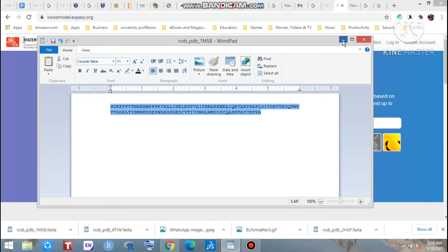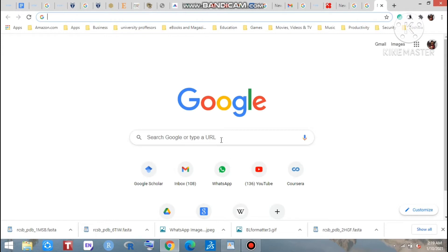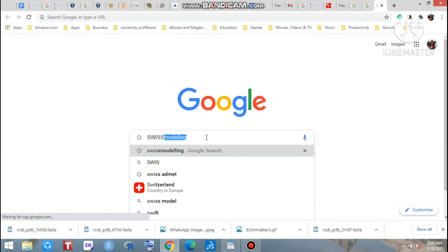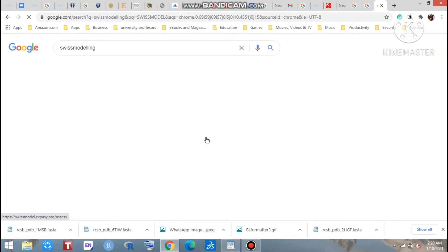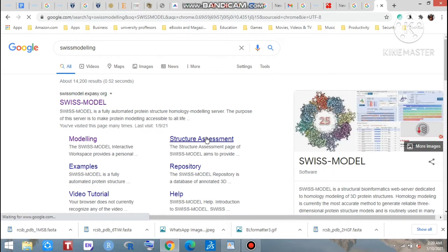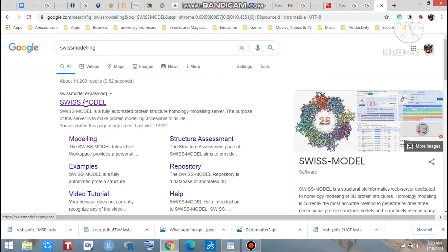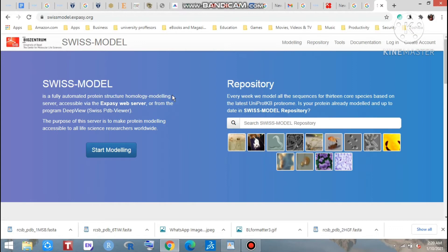At first you should go to the search engine of Google. Just search here SWISS-MODEL. Look at that. If you search here Swiss modeling, you may get swissmodel.expasy.org - that is the official website of SWISS-MODEL. Yes, in this online web server we can predict the 3D structure of our unknown sequence.